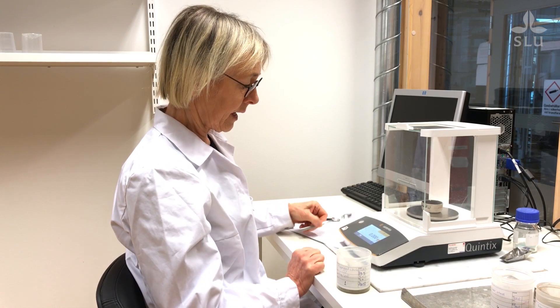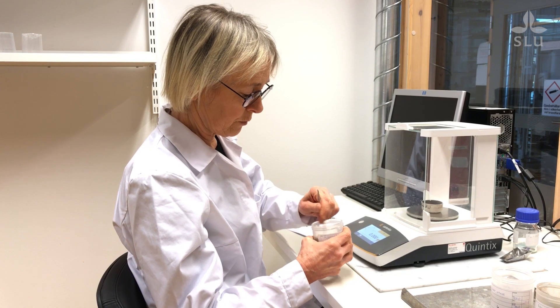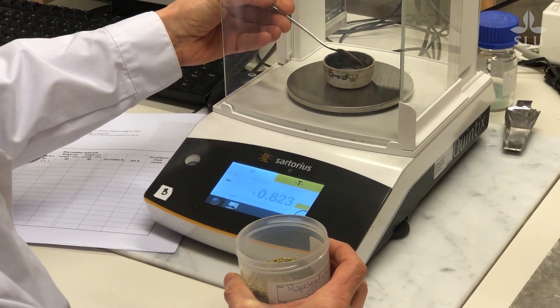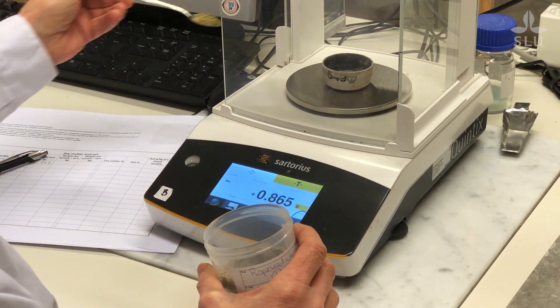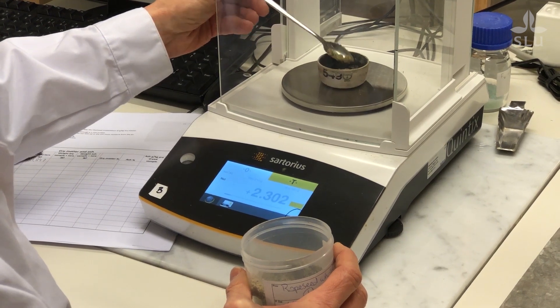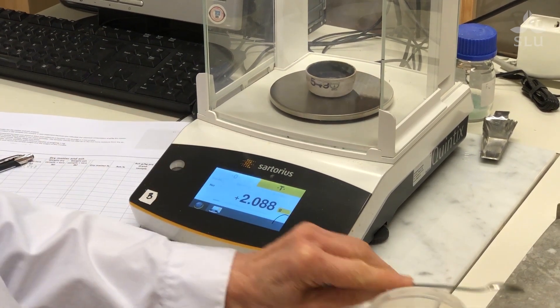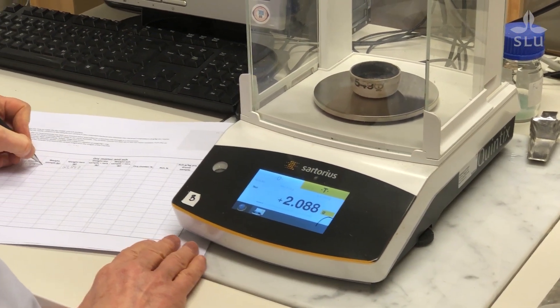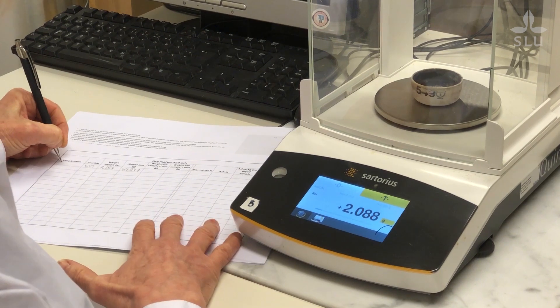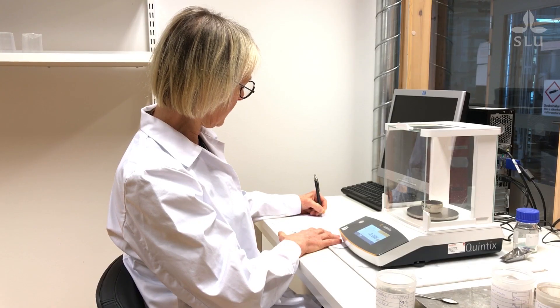I tare the balance. It's important to mix the sample before weighing because we want a representative sample. This is approximately two grams. I record the weight of the sample. This was rapeseed.